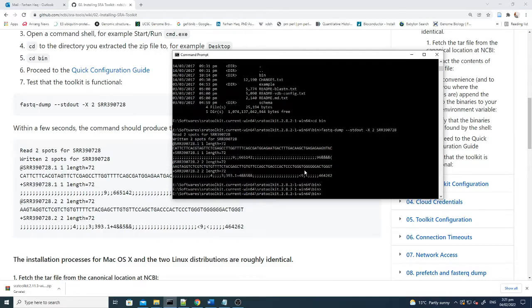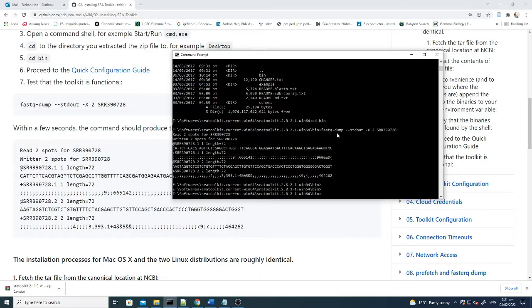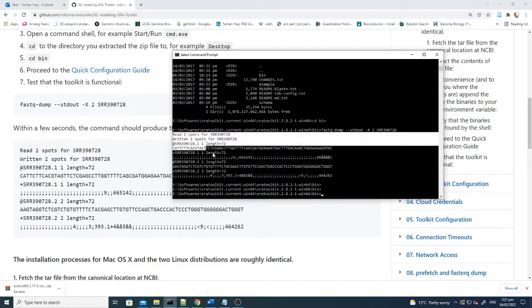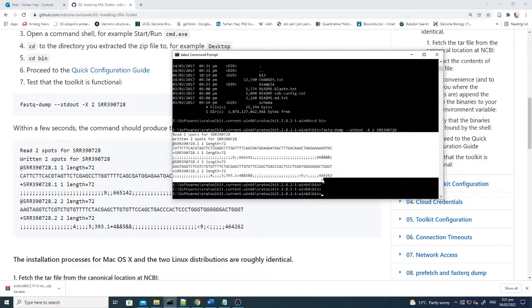Here you can see that after writing this fastq-dump standard out and this accession number, I've got the similar output just like the output given in the documentation. So it means our file is working.